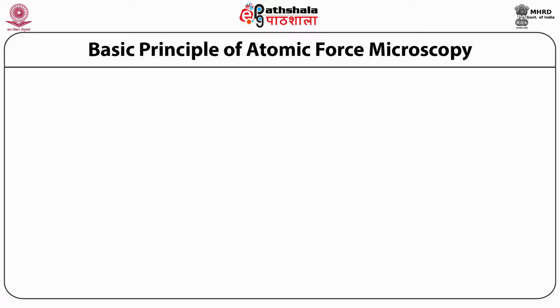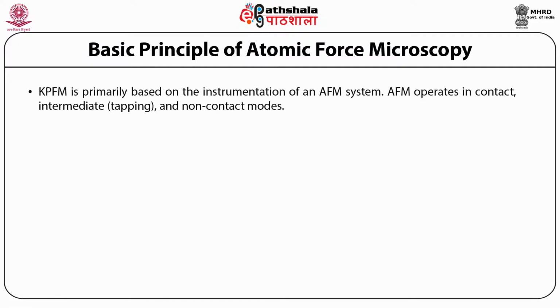After having seen these various kinds of measurements by AFM and other mode, FM mode of KPFM, we can now concentrate on the basic principles of how this is going to be working. KPFM is primarily based on the instrumentation of an AFM system.